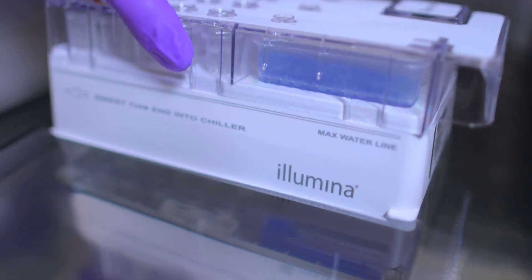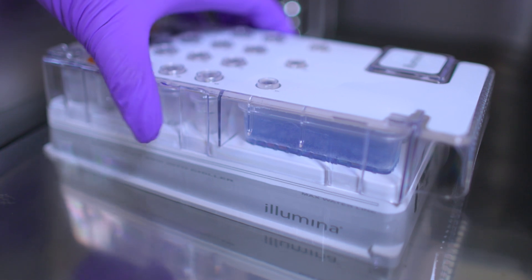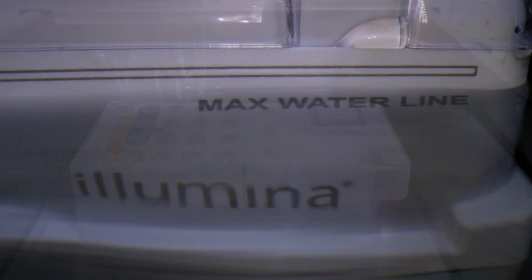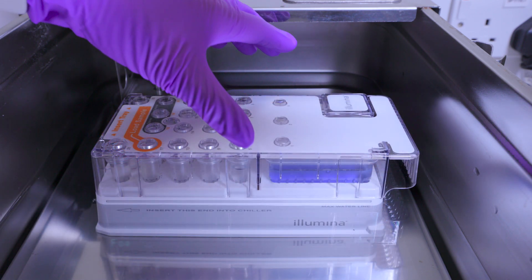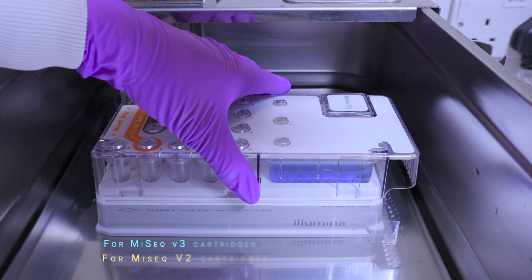Do not allow the water to exceed the maximum water line printed on the reagent cartridge. Allow the reagent cartridge to thaw in the water bath for around 60 to 90 minutes until it has thawed completely.